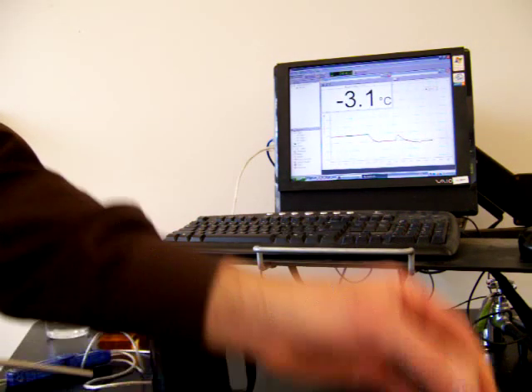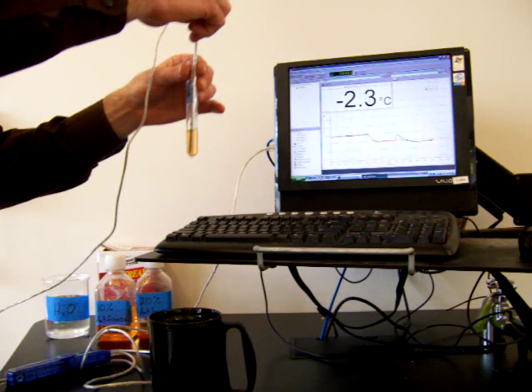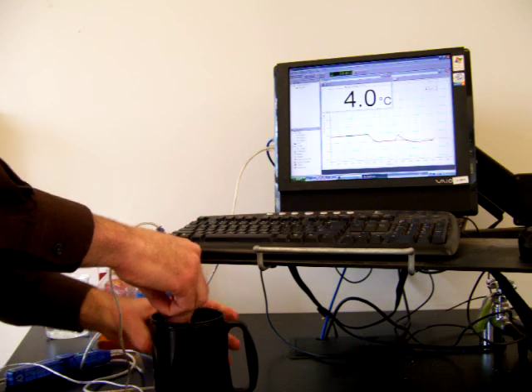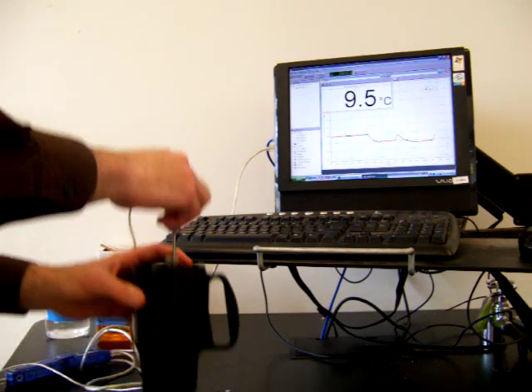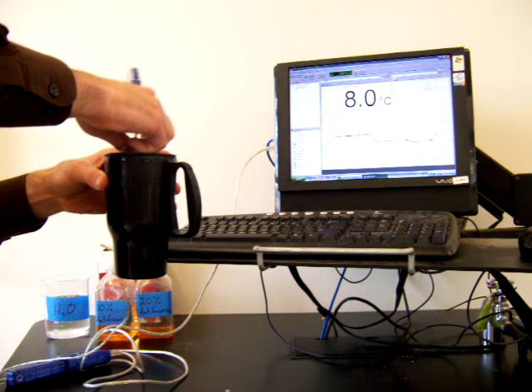One more solution to go. We're going to take the 20% antifreeze solution. We're going to expect this one to have the lowest freezing point. We'll drop this one into our ice bath. We'll stir it around. We're letting it cool.